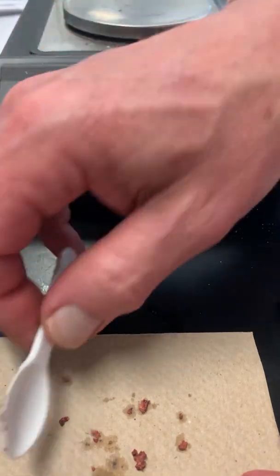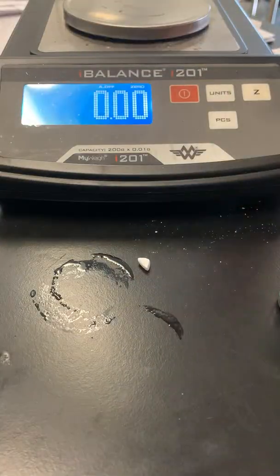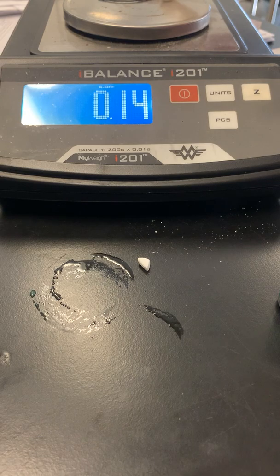So I've been letting some air dry. So here is the aluminum. It has lost mass. So remember it was about 0.2, and now it's 0.14.